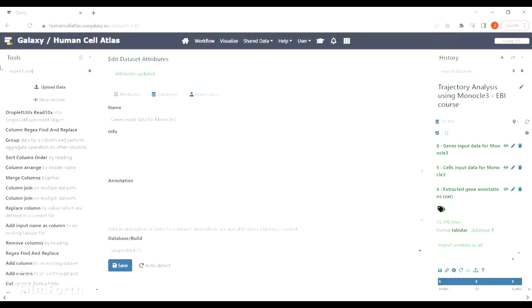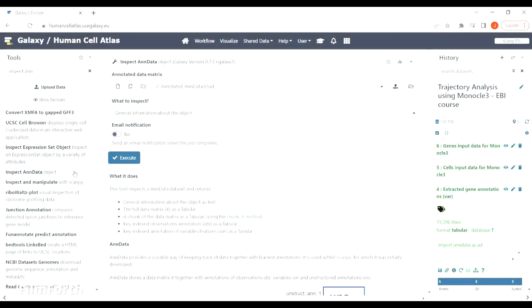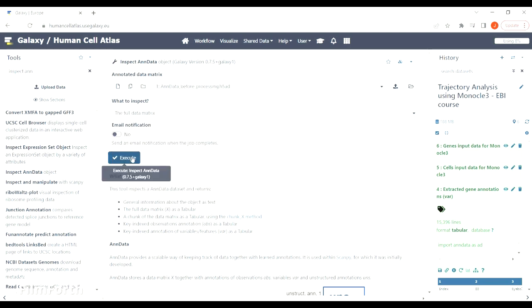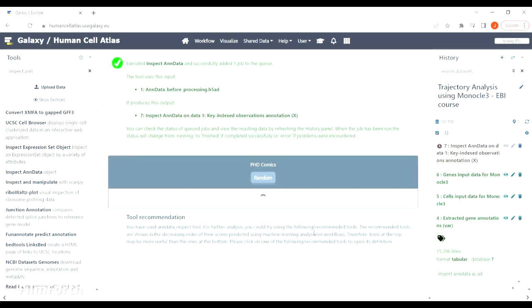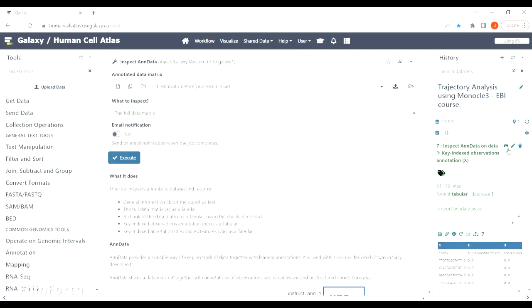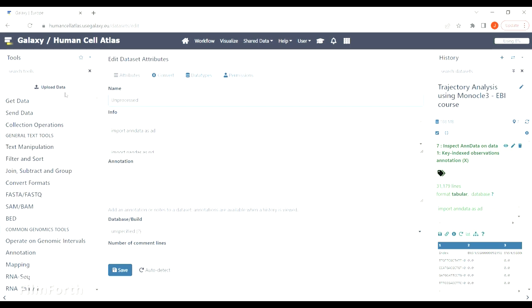First we need to extract the full matrix from anndata in the same way as we did with observations and variables. We want to keep things tidy, so again rename the file.